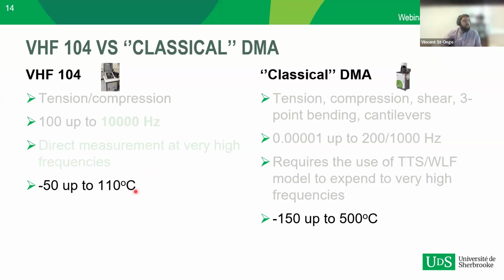You also have access to temperature control on the instrument. So if you would like to span the frequency range, you can also perform the TTS model with the VHF-10-4. For sure, the temperature range is a bit more limited than what you get on a classical DMA, but it's still more than enough for most typical needs.